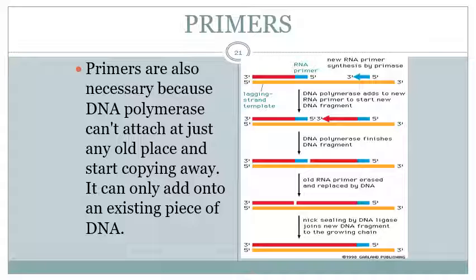When it is bound, the polymerase can synthesize the new segment of DNA in the 5 prime to 3 prime direction.